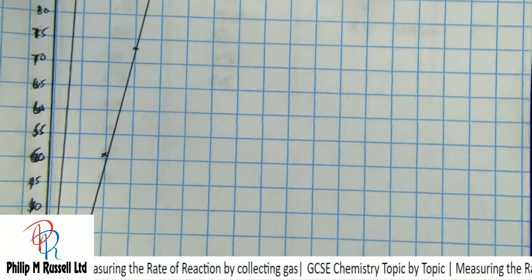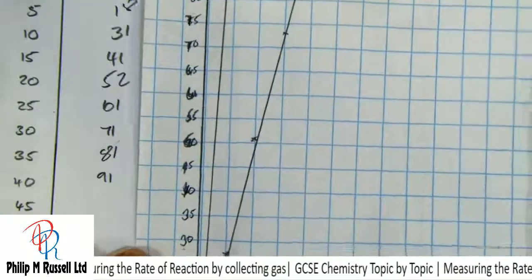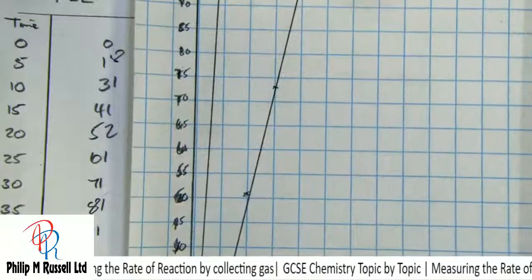Then for our last set of data, let's just have a look and see what we've got.